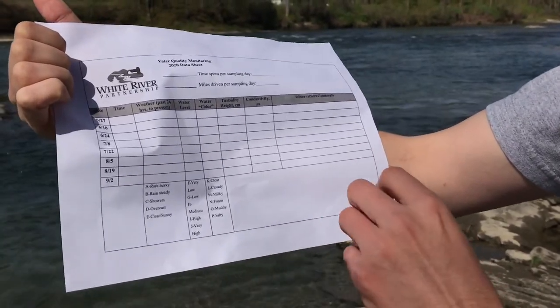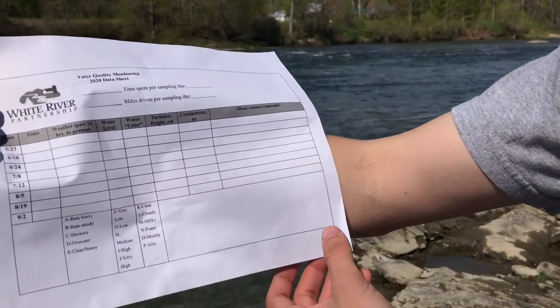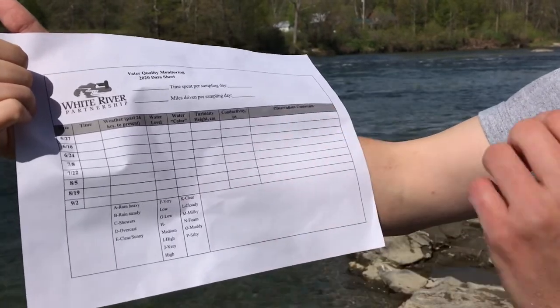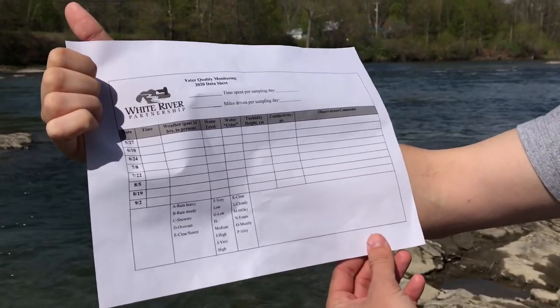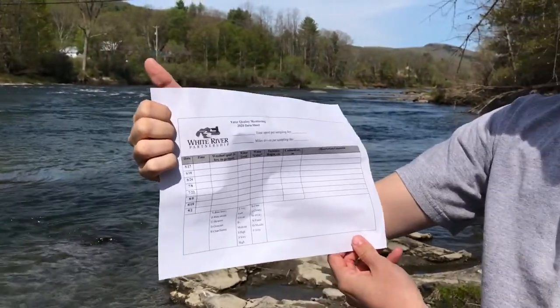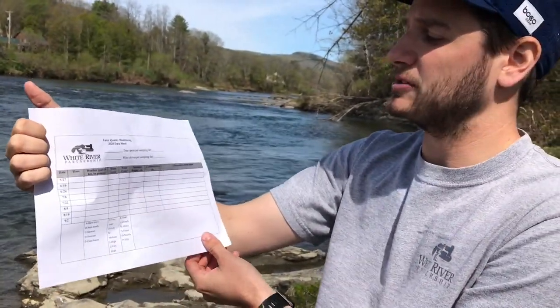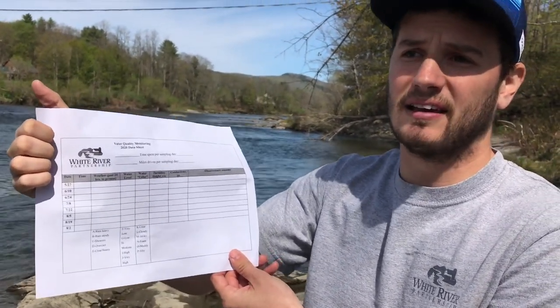And then you need to make sure that you write down the turbidity that you measured that day and the conductivity that you measured that day. And then lastly, we'd like you to enter in any observations or comments that you have about the conditions of the river when you sampled. So make sure that you fill this out. At times we may lose the data label that you put on your bottle, so it's important that we have this, so if we need to follow up with you, you have all the data in one place.